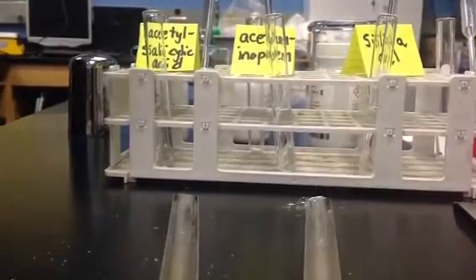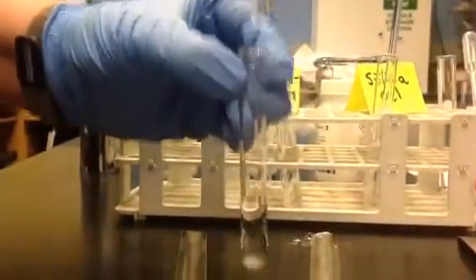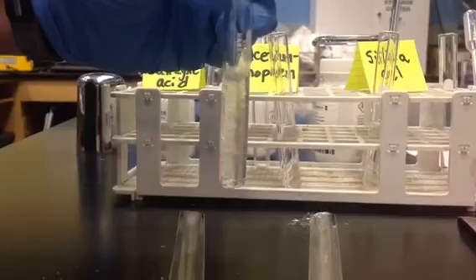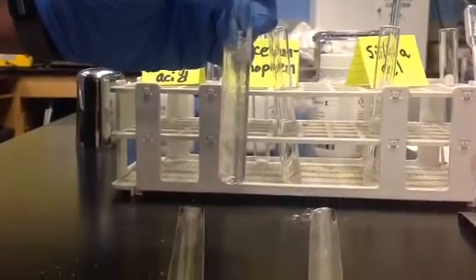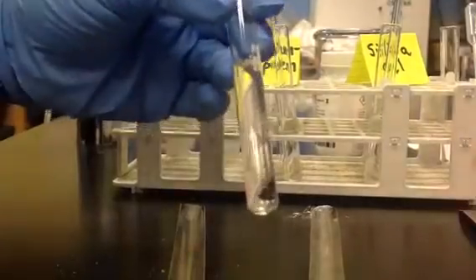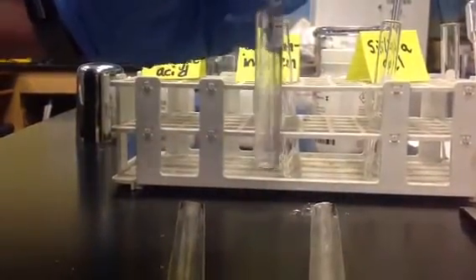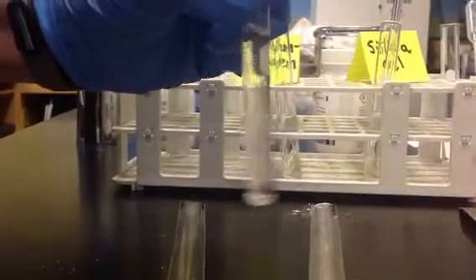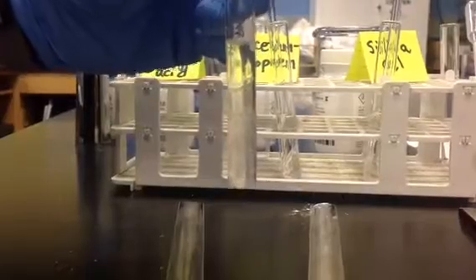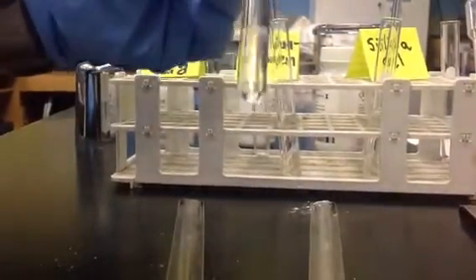And I don't need my stir rod anymore. And when I add water, I'm mainly seeing, is water going to do anything to what was dissolved in? Okay, so that's my water. Again, I'm going to stir my two solvents. Water is a solvent in ethyl acetate. Did anything precipitate out? That's what you're looking for.